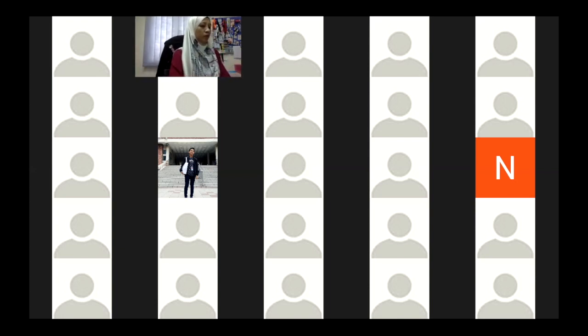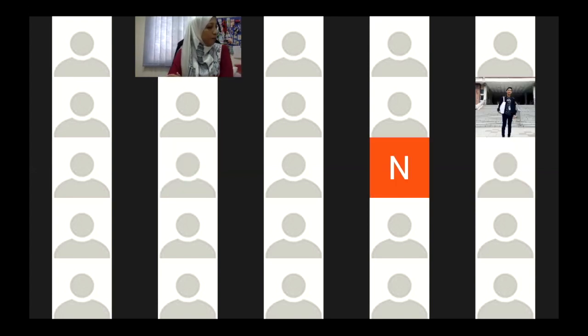Usually when you try to find the method for GC analysis, all the parameters should be explained in detail in the paper. For example, what is the model of the GC? This could be any model; the commonly used one is Shimadzu. What is the column that can be used?